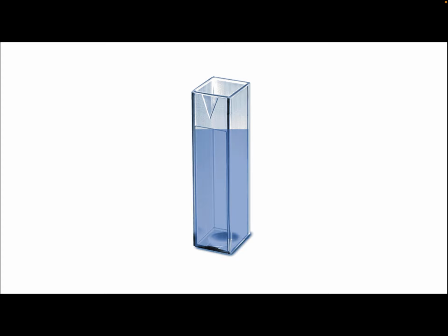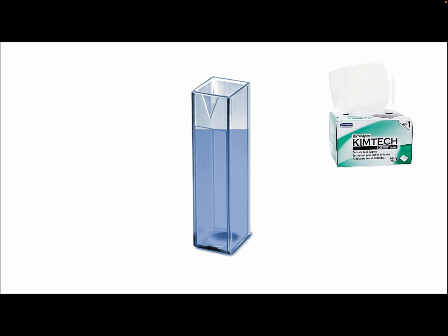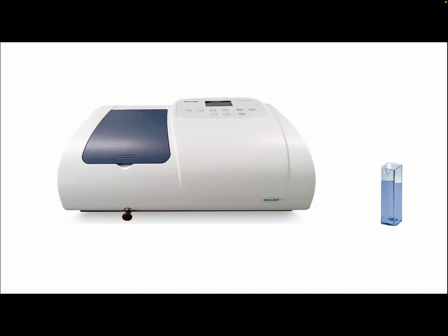And then you're going to take your sample to the spectrophotometer room along with your blank. And you're going to wipe the sides before you put it in the spectrophotometer. Okay? And then next, before you use your samples, you're going to use a blank to zero out the machine and find the best absorbance length. Following the procedure, which you would also use to measure the absorbance of your samples.